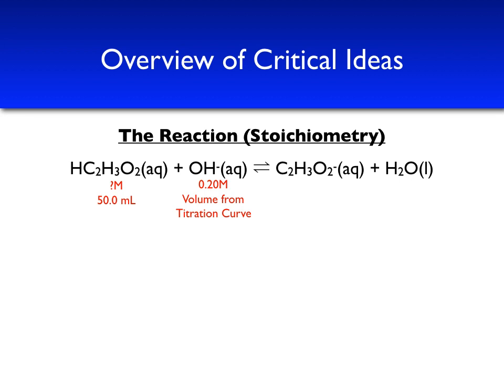The goal of this experiment is to see how much sodium hydroxide it takes to reach the equivalence point of the titration. This can be calculated as a first prediction if you have this concentration of acetic acid. You'll be asked to do this in your lab assignment. You can then estimate the volume of NaOH added to see if it is consistent with your calculation.